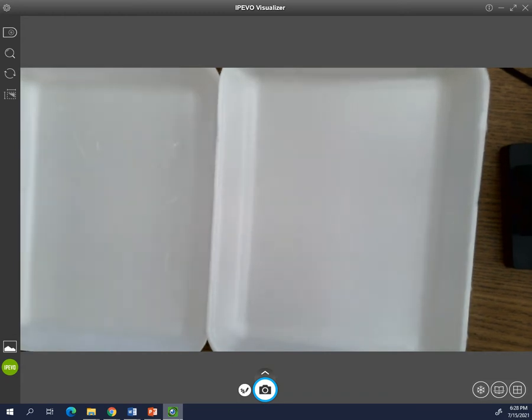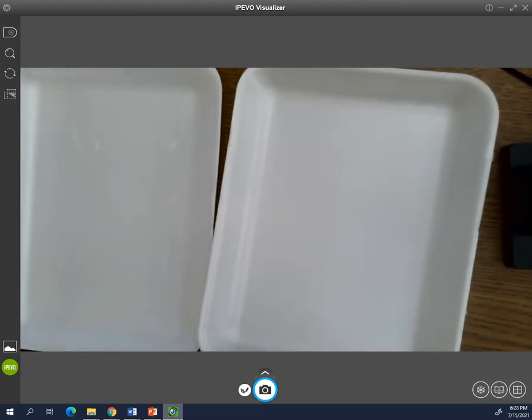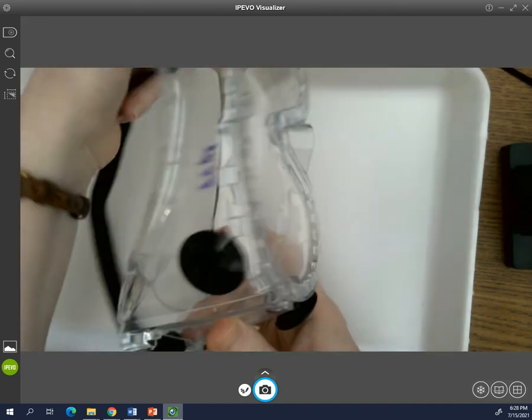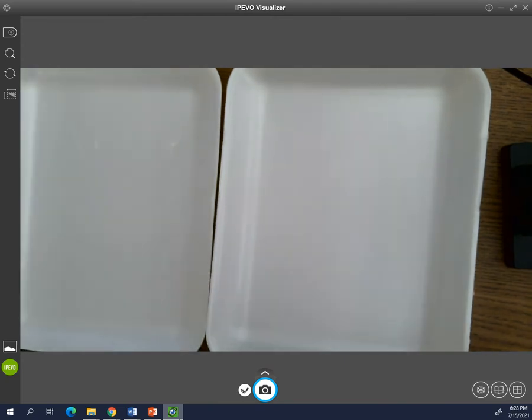Okay, so we need to make sure we are keeping things safe. So anytime you perform a lab, even if we're just using household chemicals, but to have good practice, we need to have our hair tied back, long pants, closed-toed shoes, and of course our safety goggles and aprons. So that is what we are going to be using. So I'm putting mine on to get this started. Okay, so those are the safety features.